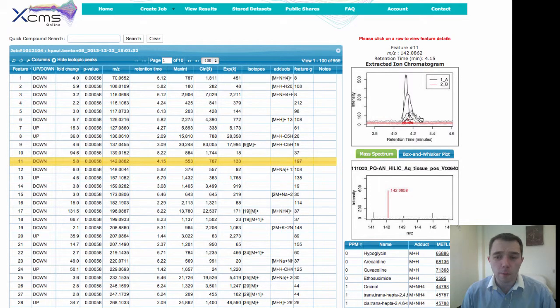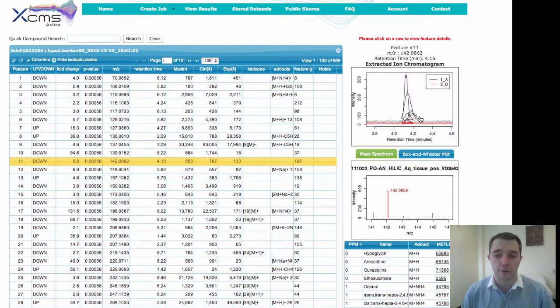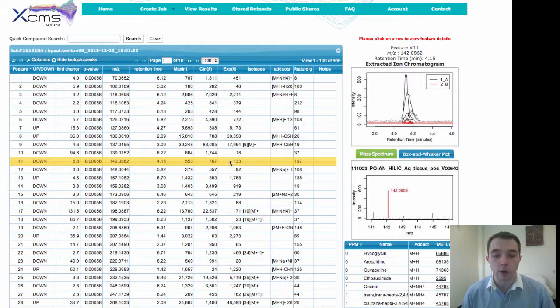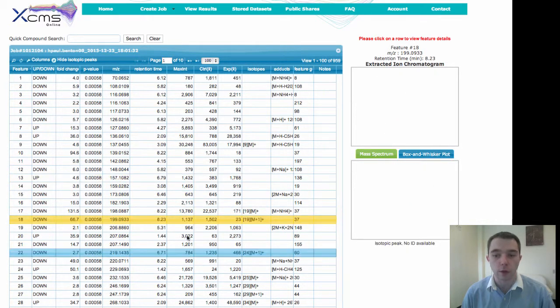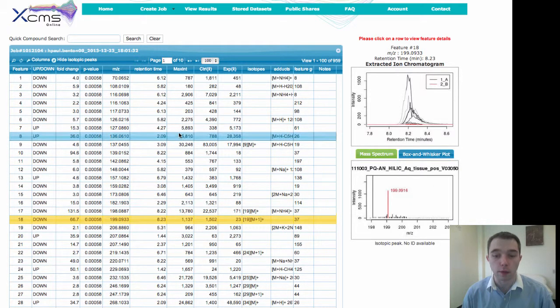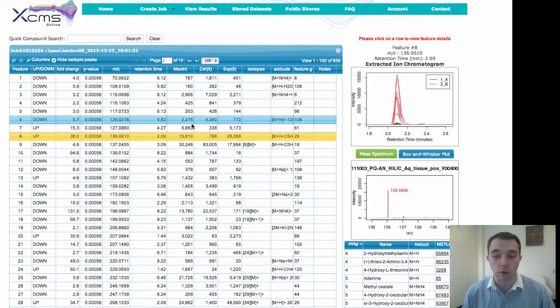The extracted ion chromatogram is from the actual raw data of your mass spec file, showing the intensity and the actual peak in retention time of your actual feature. You can click through on each one of your different features and see what the actual raw data looks like.